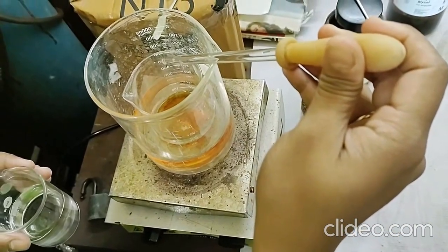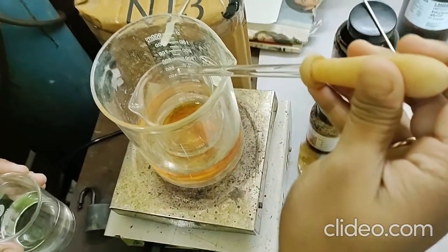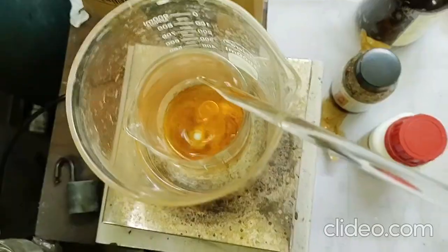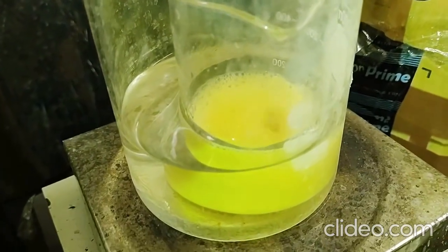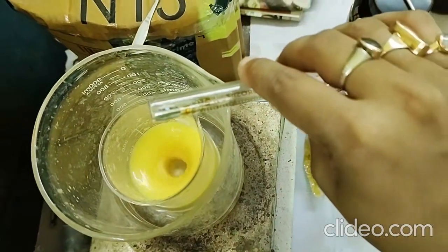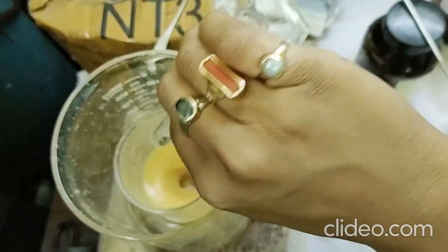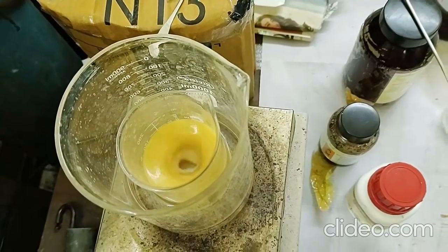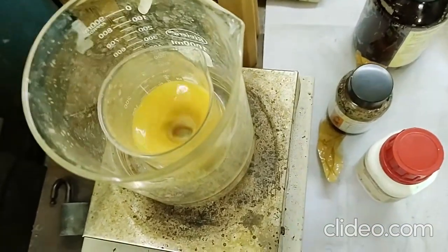We can see that after a short time the color of the solution will change, and next we are continuously stirring for 5 hours. Now you can see that the color of the solution has changed. Now to change the pH of the solution, a few ml of ammonia is added, and you can see that the color of the solution changes again. And now we continuously stir it for 5 hours at 80 degrees Celsius.